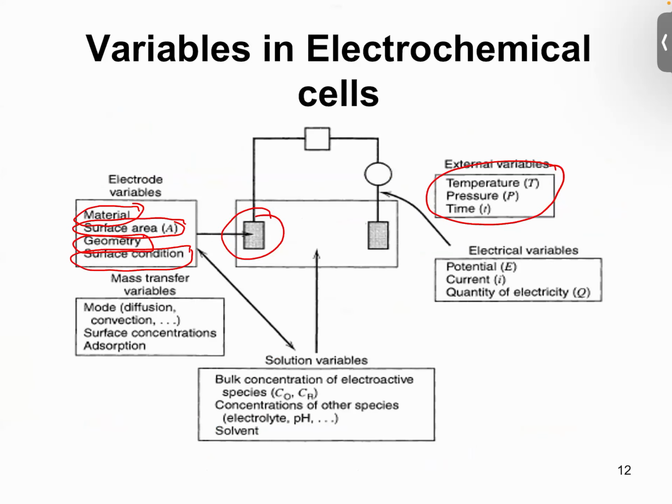We need to consider what the response time is, whether you're going to have a very fast reading or it's going to be slow. Right. The other issue is, because of this, we need to consider material because it regards how the sample will diffuse.